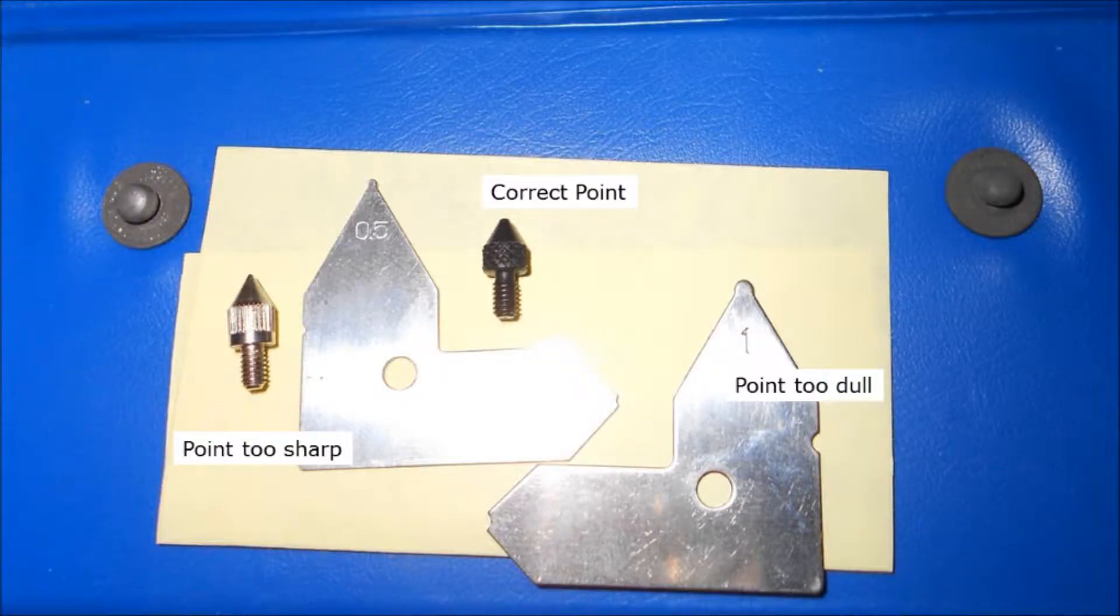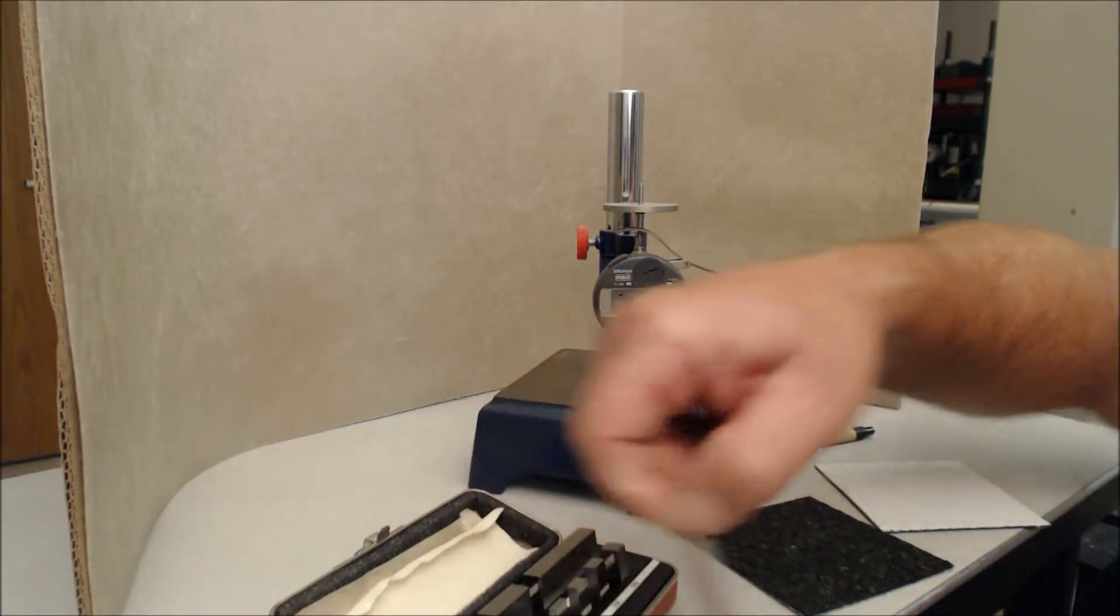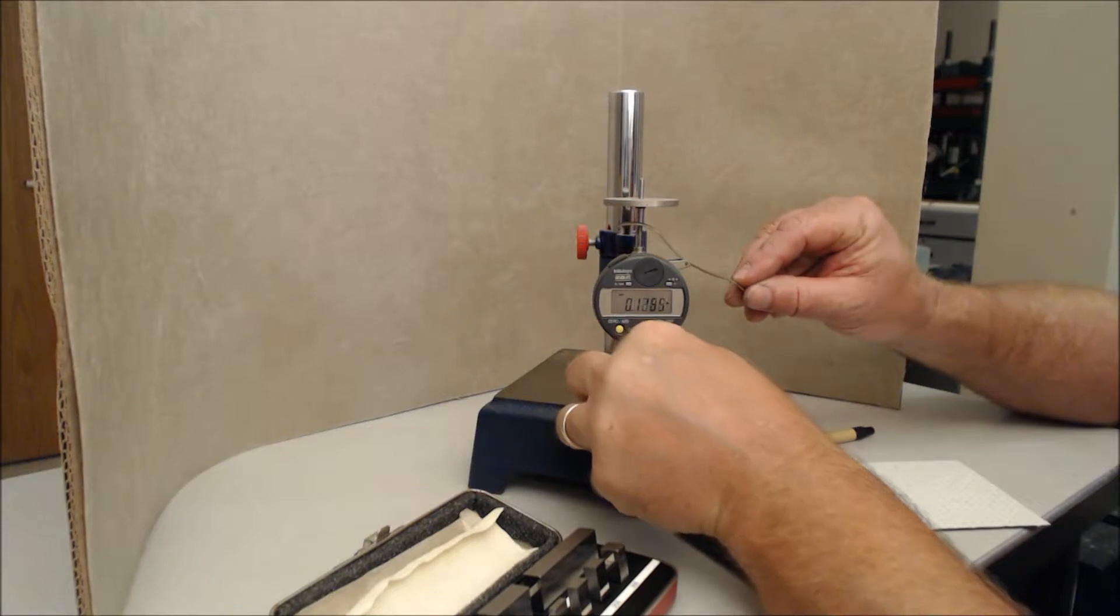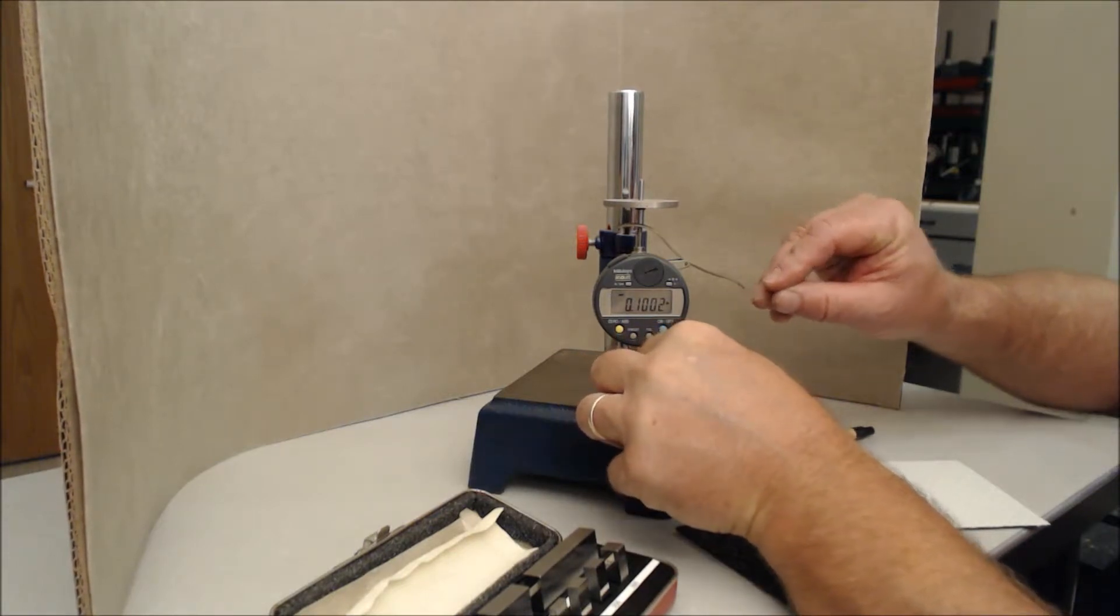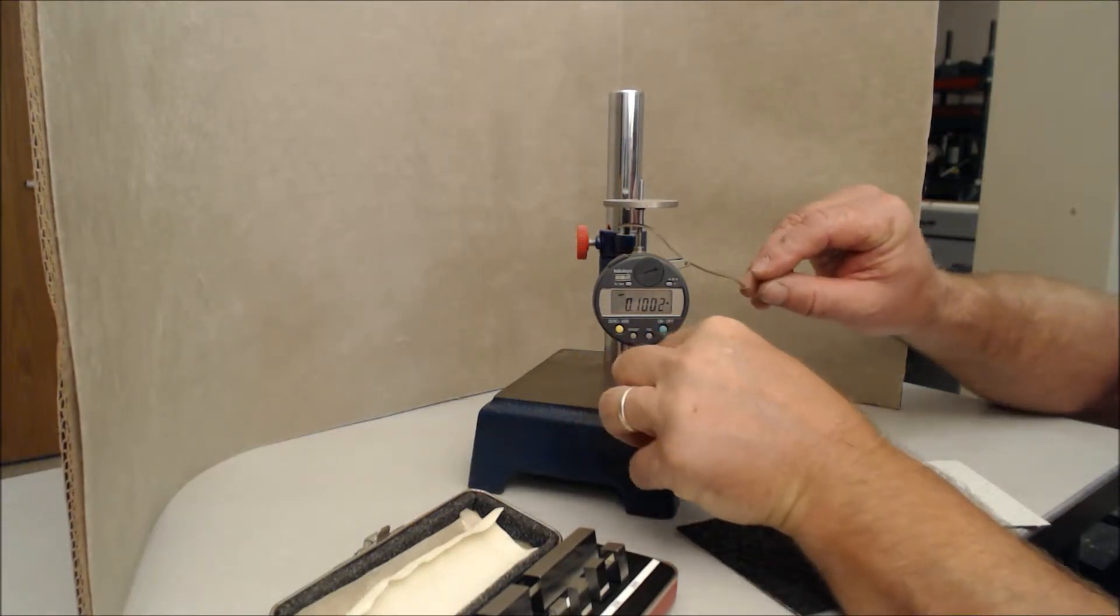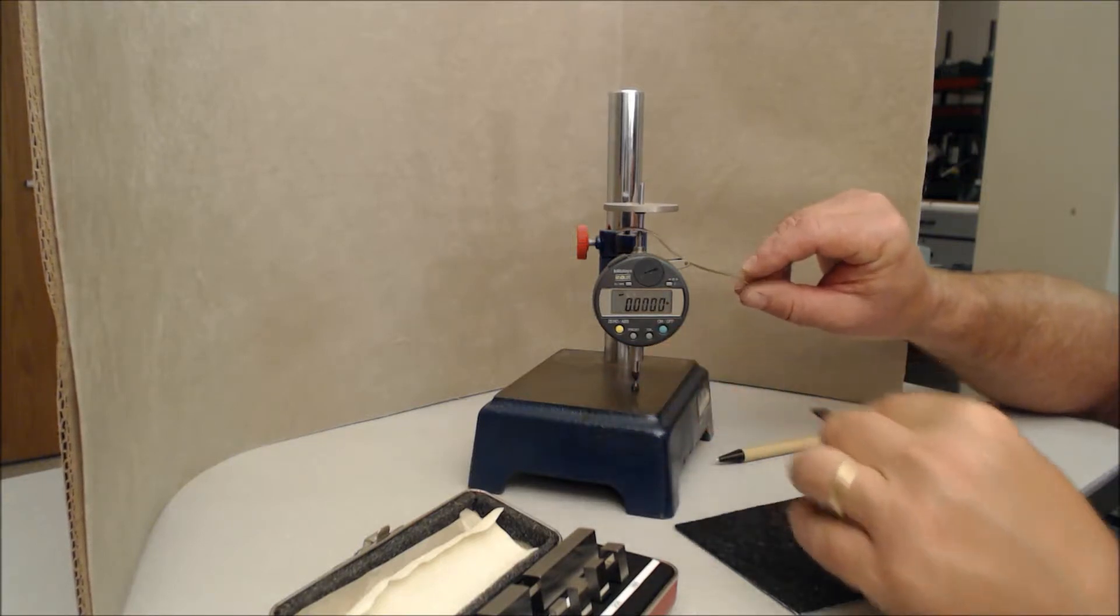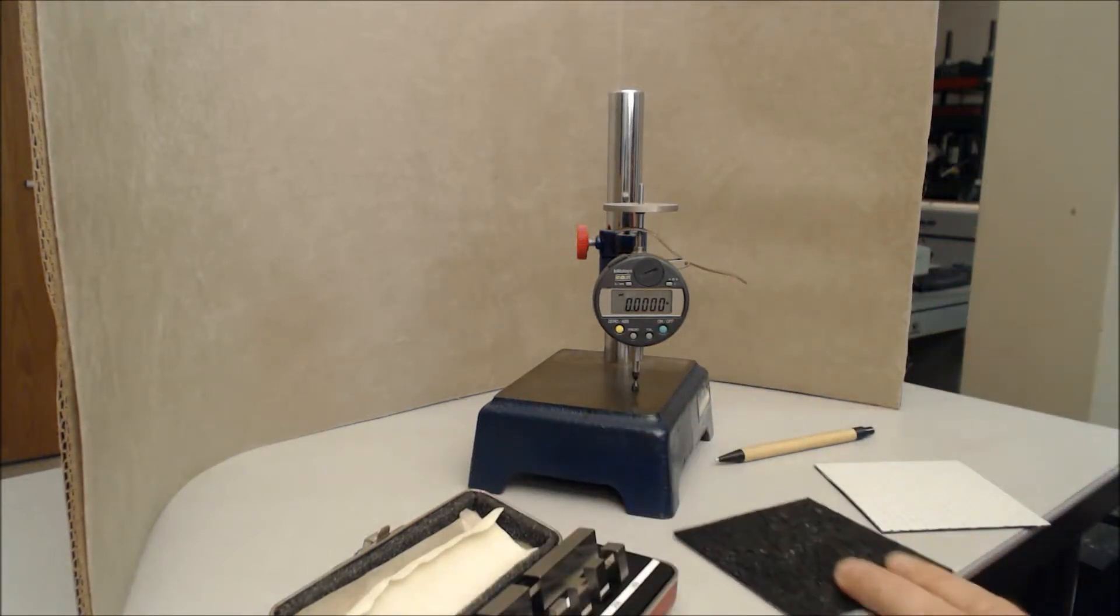This apparatus is plumb. You have to verify this, and you can verify this with the gauge blocks. We saw that earlier, and here you see the reading. It's a little difficult because you're going to point-to-point contacts, but this is just a quick verification that the apparatus is reading correctly.